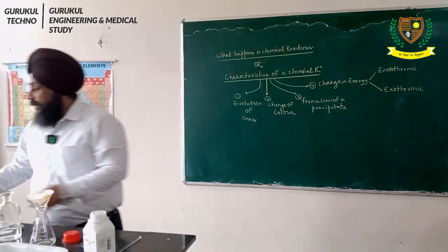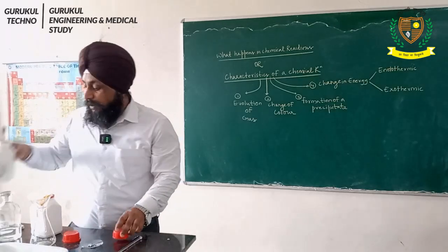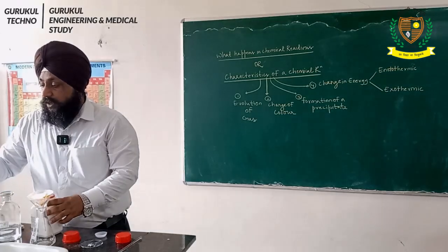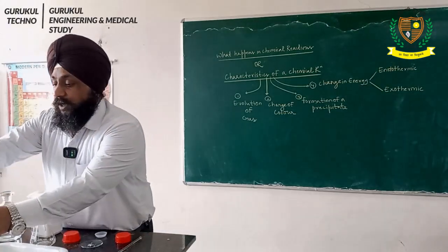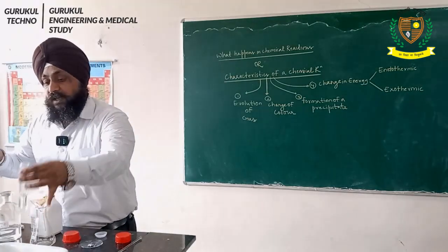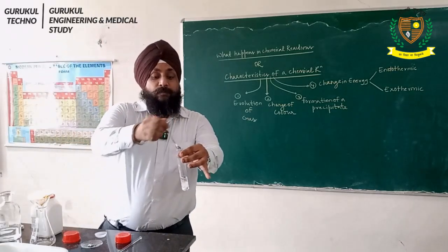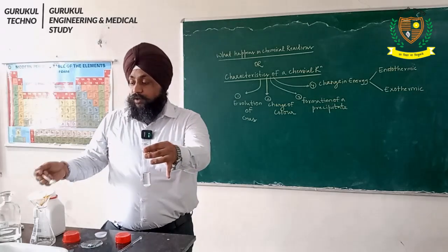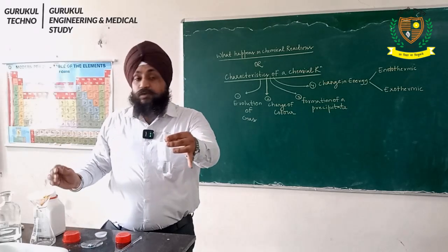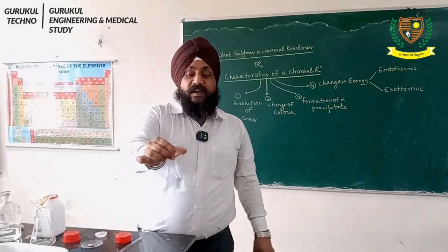Now students, another important reaction which we are going to understand. Again we will take tap water over here. To that I am going to add ammonium chloride. And what is going to happen, students? The test tube is going to become very cold.